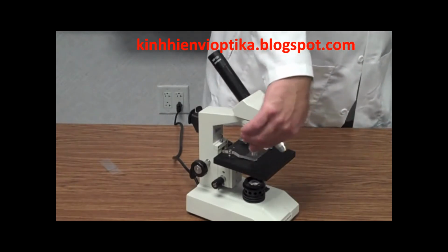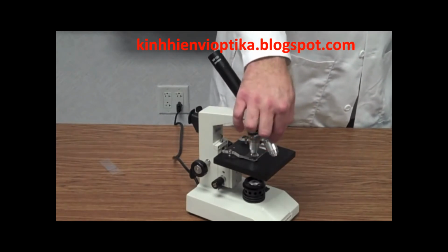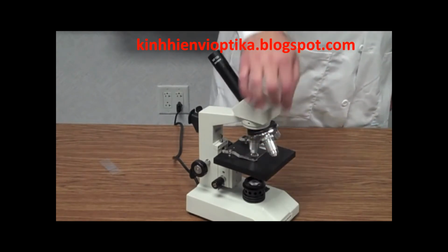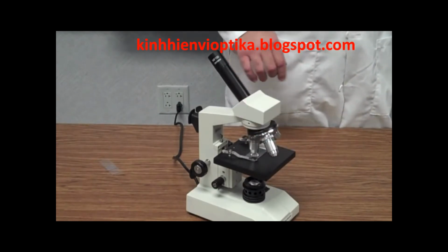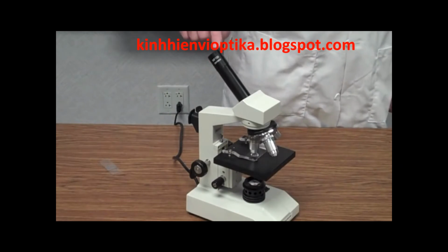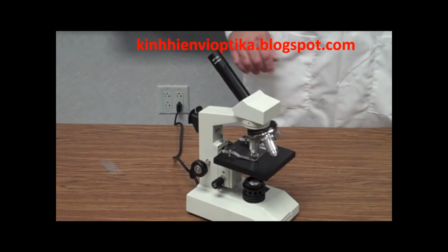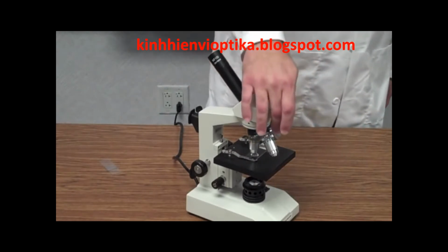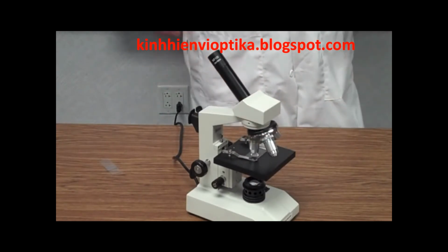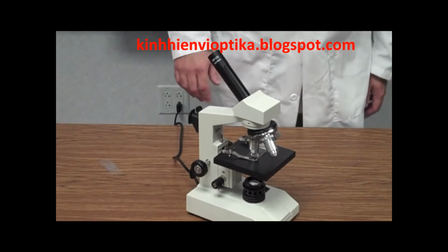Okay. Lastly, we have the high power objective. It's kind of got an aqua blue colored band on it. The high power objective magnifies the image 40 times. So if you take that with the eyepiece, which is 10, 10 times 40 is 400. So the high power objective magnifies the image 400 times greater than it is just looking with your normal eyes.